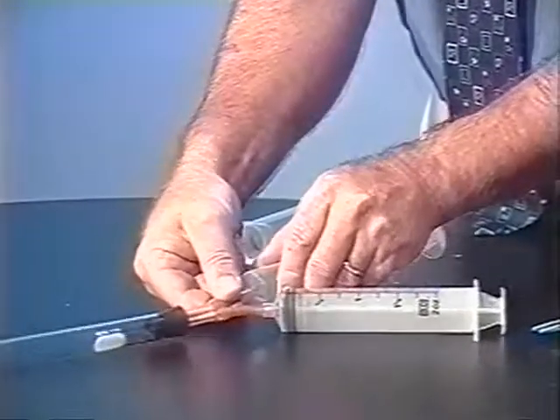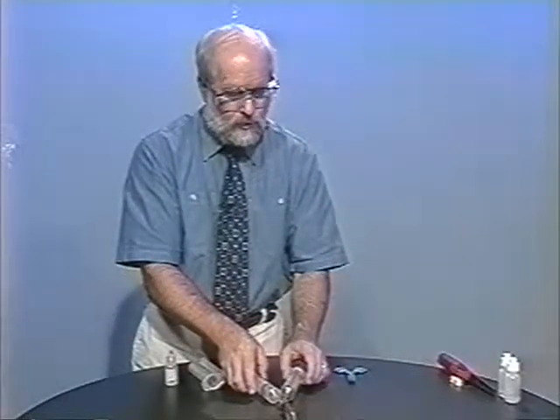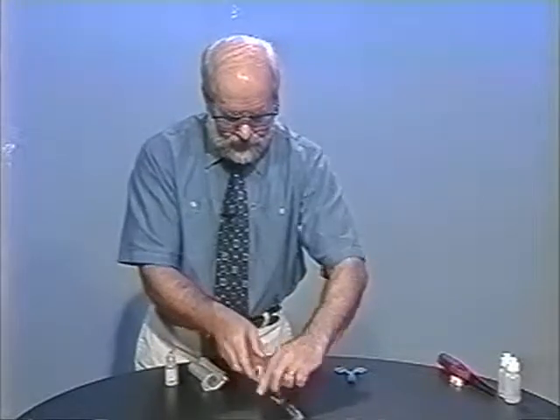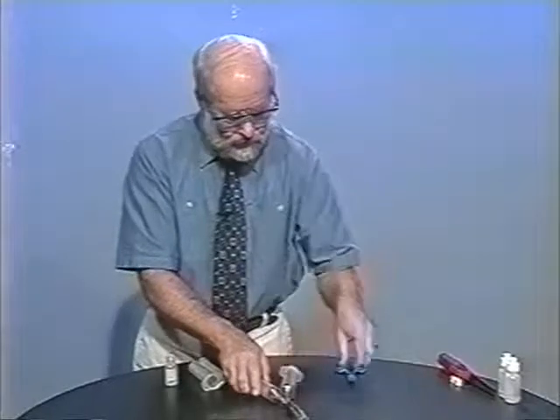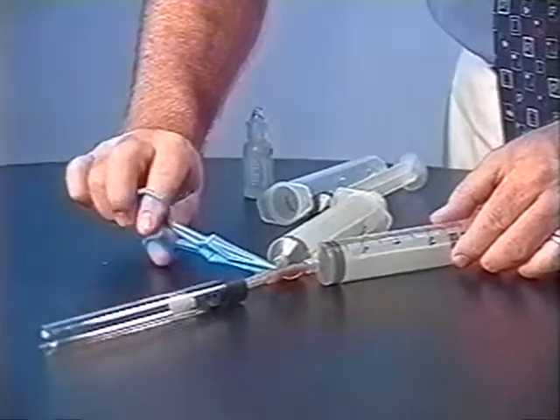The syringes have been lubricated with silicon oil so that they move very easily within the plunger. Other oils work as well, but vegetable oil doesn't work very well with hydrogen chloride and some of the other gases. We also use a small plastic hemostat, and we can clamp off one syringe.